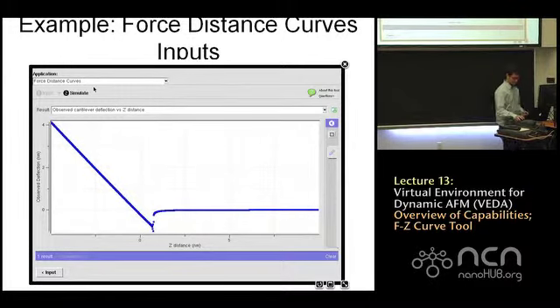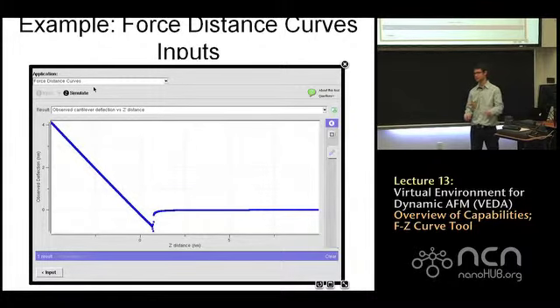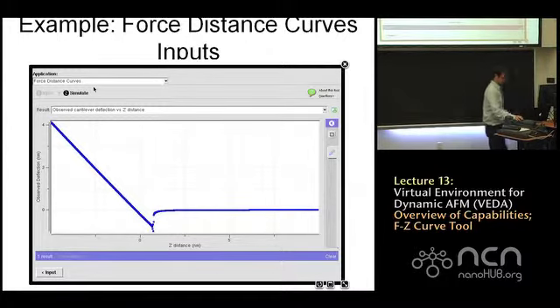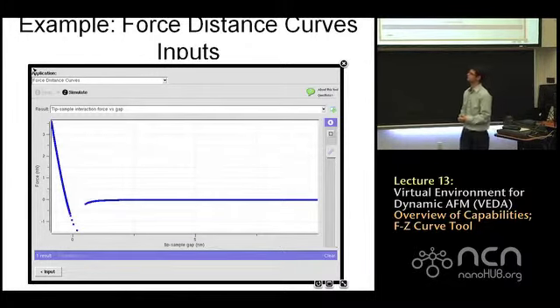As I believe you covered on Tuesday, the force displacement curve is not the same thing as the force distance curve. By force displacement, we mean force versus the displacement of the base of the cantilever. But a more fundamental property of the sample is a force versus gap curve. So we want to subtract the deflection from the z distance, and we'll get something which represents the displacement of the tip. If we select from the drop-down menu tip sample interaction force versus gap, we'll get this plot.